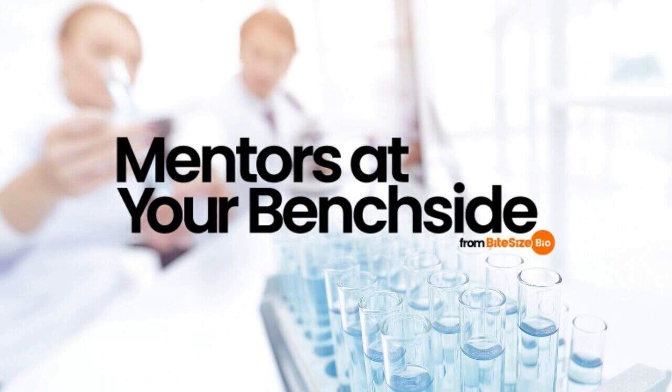If your sample is fluorescent, part of the light will pass back into the objective lens. This light travels back through the same path that the laser travels. The effect of the scanning mirrors on this light produces a spot of light that is not scanning but standing still. Number 2. Sample scanning.